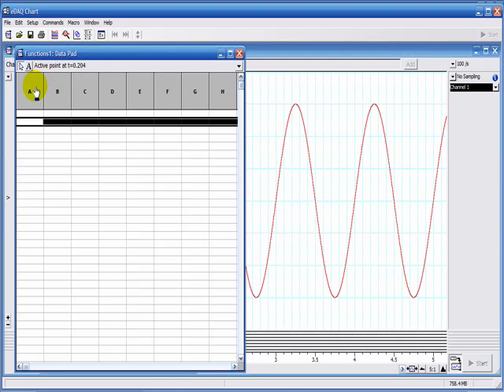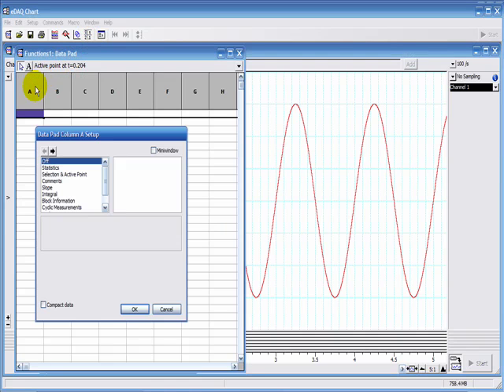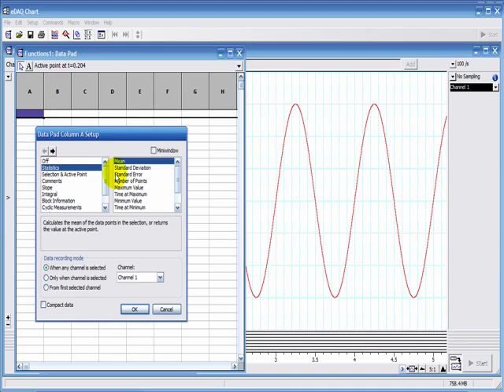You click on one of the column headings and you choose the calculation you want to do. So in column A, I'm going to choose to do the mean of channel 1, and here it tells you exactly what it's going to do.